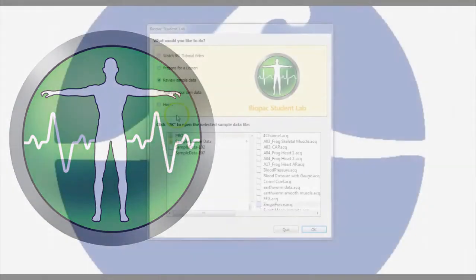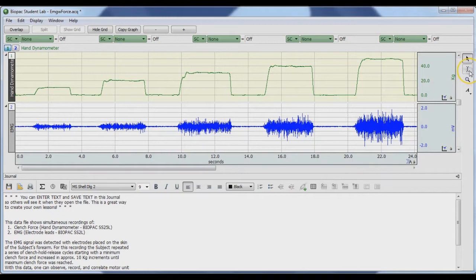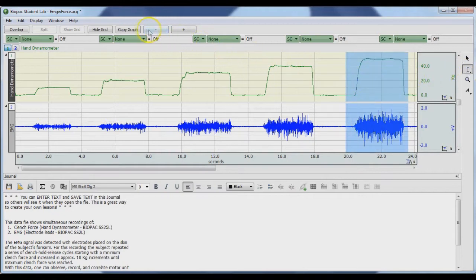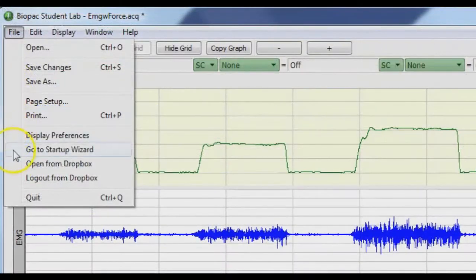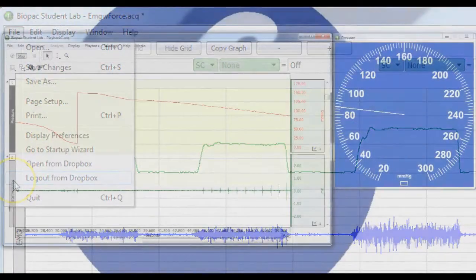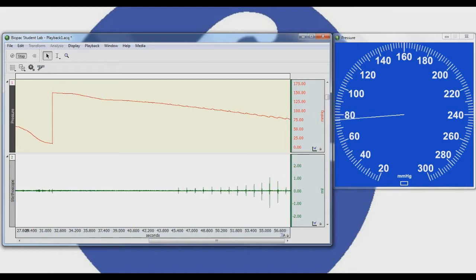Free BSL student software provides tools for lesson prep and data analysis outside of class, so lab time can be focused on enabling more students to record data from their own bodies. Data can be printed, emailed, or sent to Dropbox from within the BSL software, so students can easily submit assignments or share and review group data.